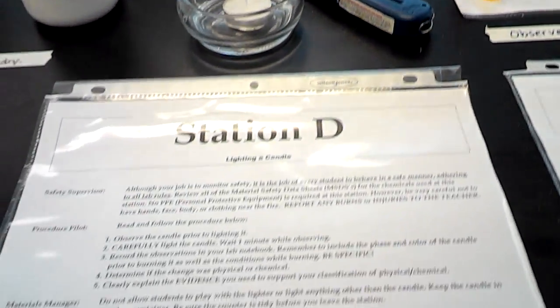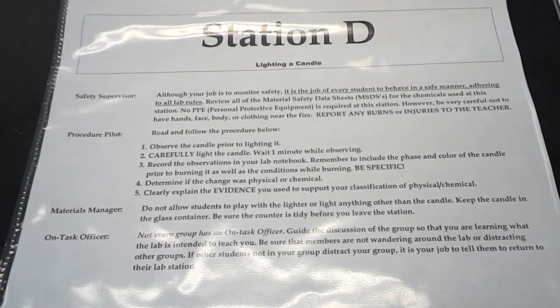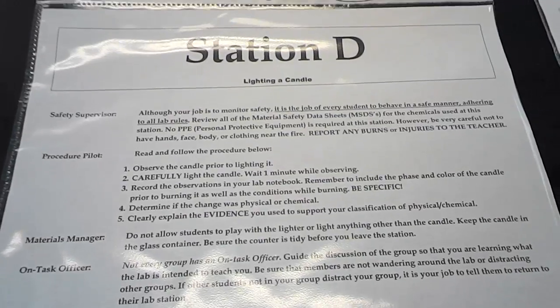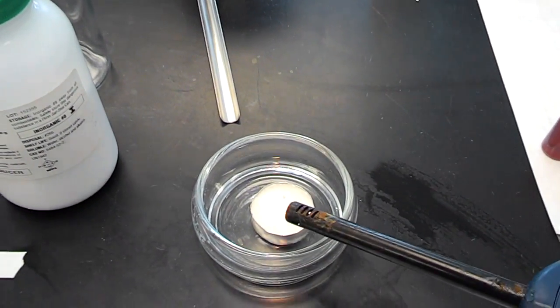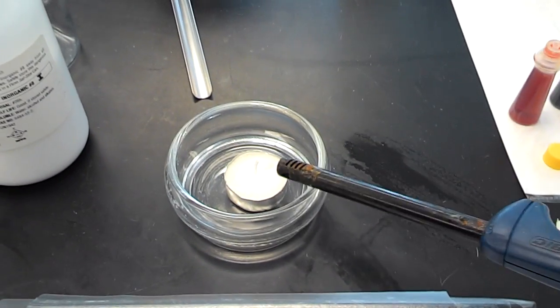Station D. Station D tells you that you're going to observe a candle. You don't need any PPE, just don't burn anything but the candle. So here's our candle. I'm going to light the candle. Well, maybe you will.